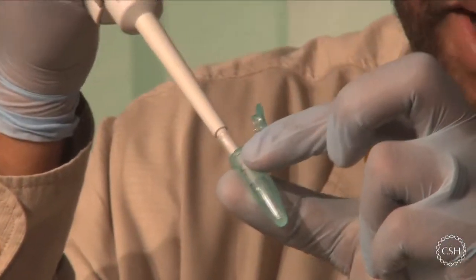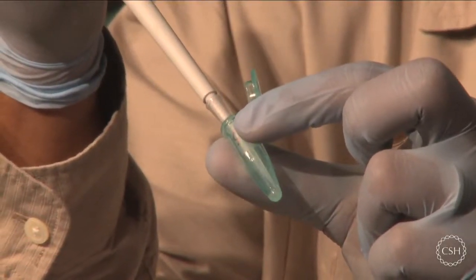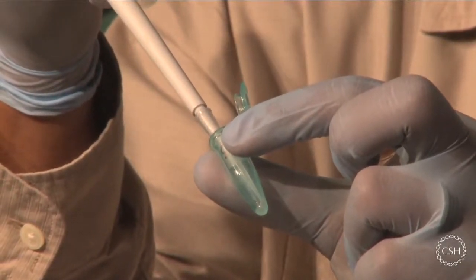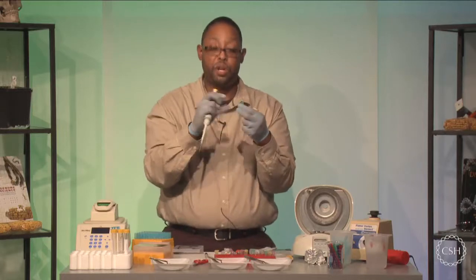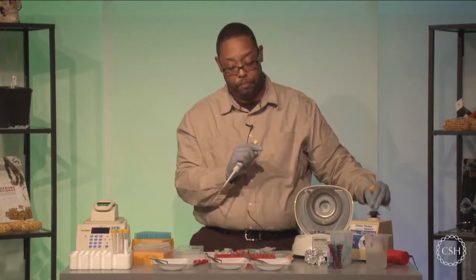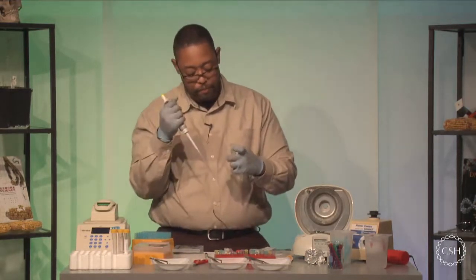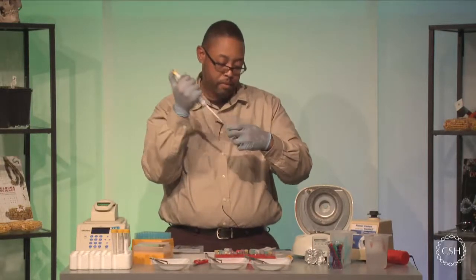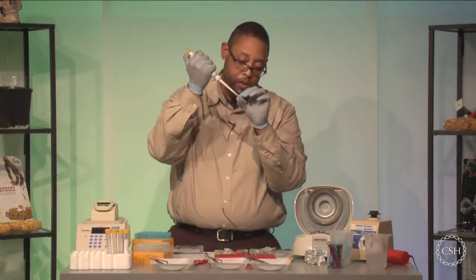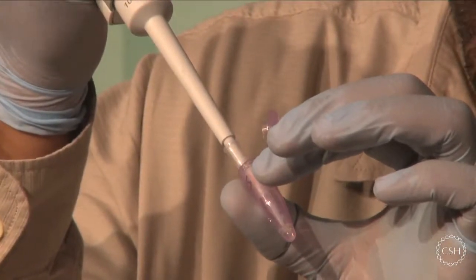And I'm basically going to break up the pellet. You can see here that I've broken up my pellet. Solution got really cloudy. And I just want to make sure it's thoroughly mixed. So you can either finger vortex or vortex on the machine once again, and then place that back in your rack. And we'll continue to do that for everything. So we'll finish out that way. We're just going to make sure everything gets broken up here.